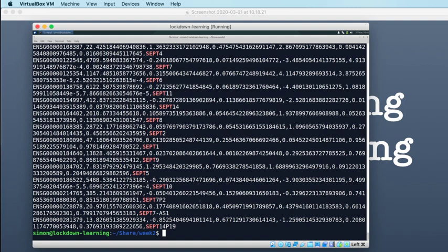In which case, I can restrict my match. Now, this is where grep starts to get slightly more complicated, because if I want to match the members of the septin gene family, but I just want sept followed by numbers, I don't want the antisense ones, I don't want these P ones, so I'm not sure what the P2 and the P19 are, but maybe they're not core members of the gene family I'm interested in. So I just want sept followed by some numbers and nothing else. In order to do that, I need to use what's called a regular expression.